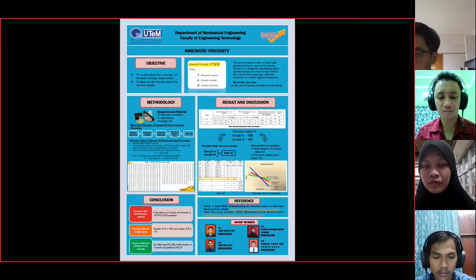From here we conclude that the higher the viscosity index, the more desirable the engine oil. Okay, that's all from the results and discussion for this kinematic viscosity experiment.